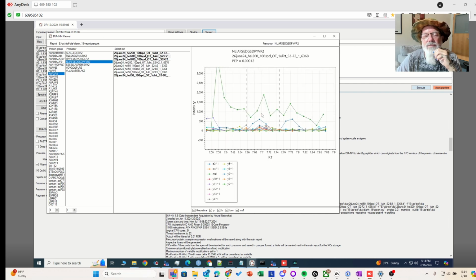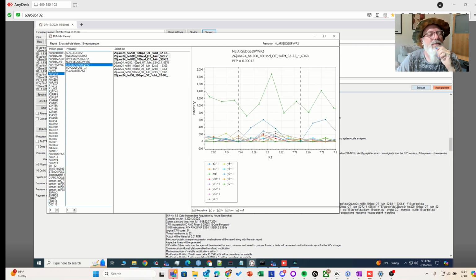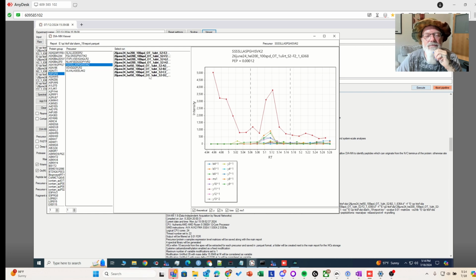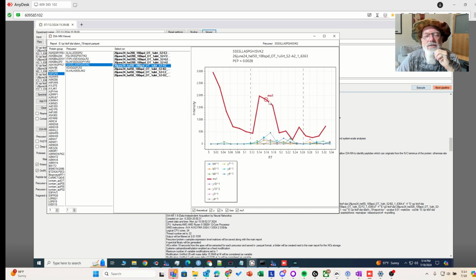Can you zoom? Maybe. Oh, you can use your mouse wheel and zoom. That's kind of cool. This might be a peptide we want to check. This one actually looks pretty good. Okay. And you can see what fragment it is. Is there no precursor? Doesn't look like there's... oh, there's the MS1. Yeah, it's red. Okay. That's probably why it collides. All right. Cool. That looks great.